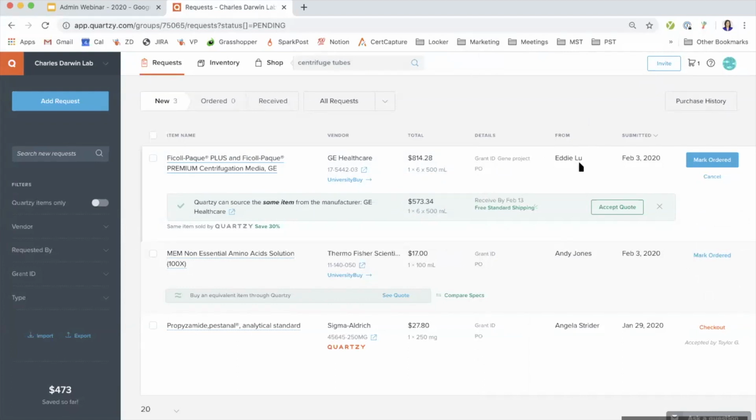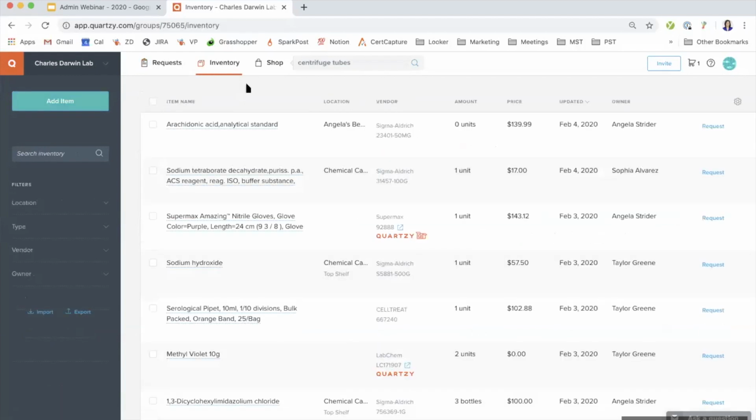All right. So can we bulk update inventory via the import tab? And does the inventory increment if we purchase an item that still has stock in the system? It's a question from Michael. Yeah, so two separate questions in there. Yes, you can bulk update the inventory. That would again be using the Excel export and import process. Note of importance here is if you're going to do a bulk update, make sure you export the most current version of your inventory before making those changes and importing it back in.